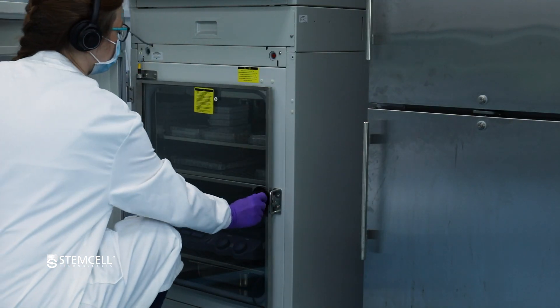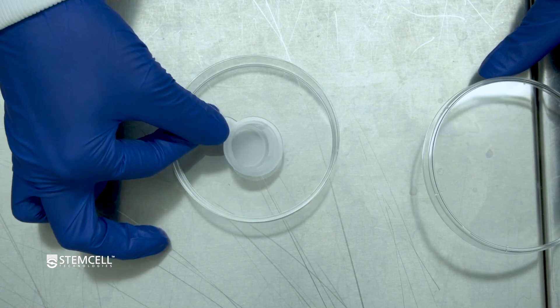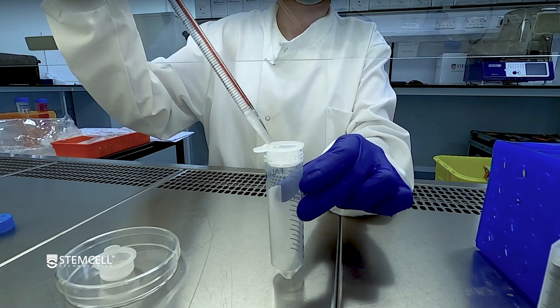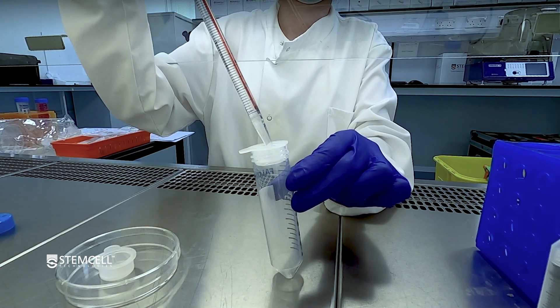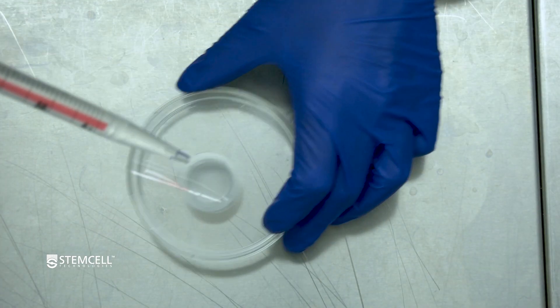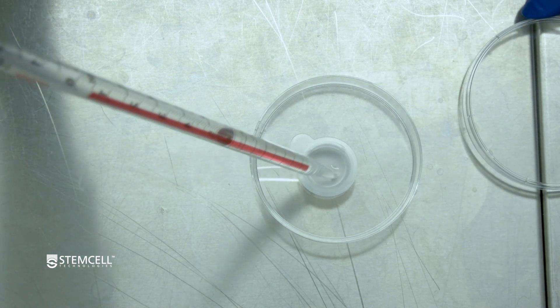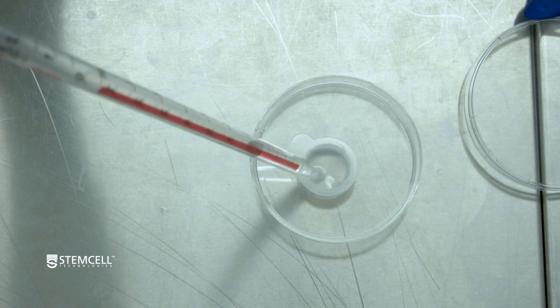Incubate at 37 degrees Celsius for 20 minutes on a shaking platform. Place one 70 µm nylon mesh strainer in a sterile culture dish and another on a 50 ml conical tube. Pre-wet both strainers with approximately 5 ml of PBS containing 2% FBS.